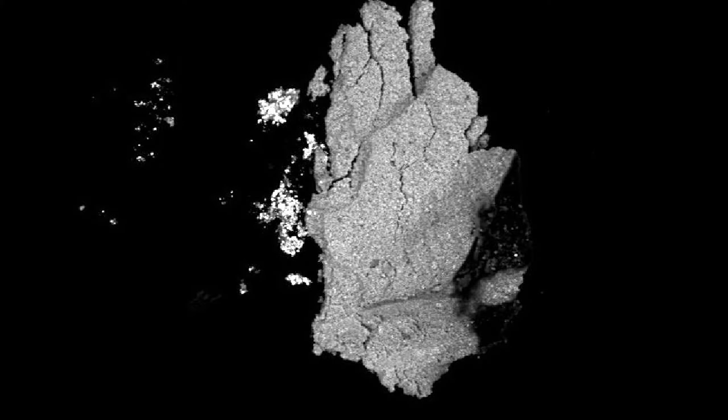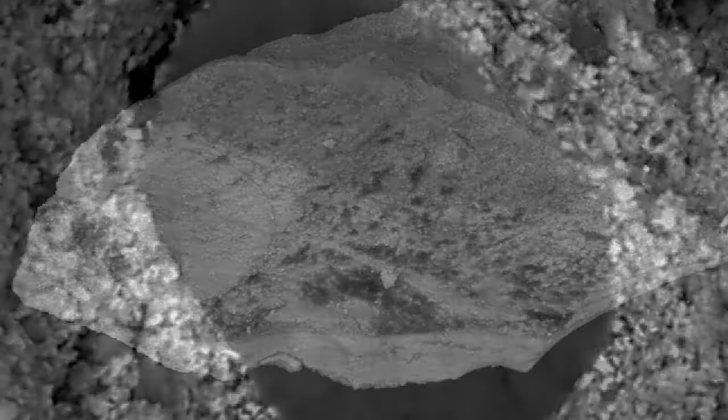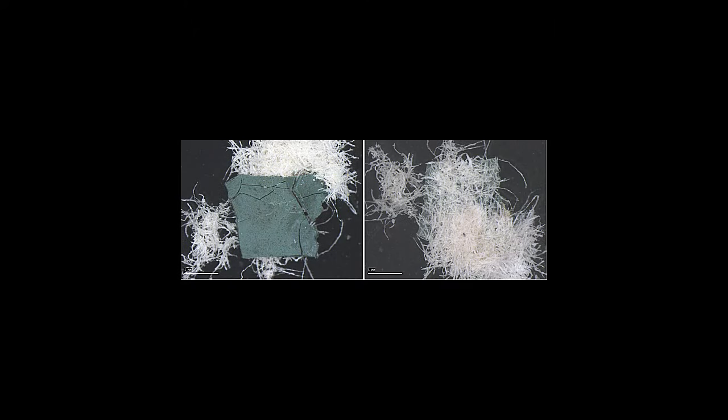Using an EDX probe, SEM also produces a spectrum of all the chemical elements that it tracks. EDX provides qualitative and quantitative analysis of the elemental composition of a sample by using a diode to measure the X-ray photon energy emitted by the area of the sample bombarded by the electron beam.